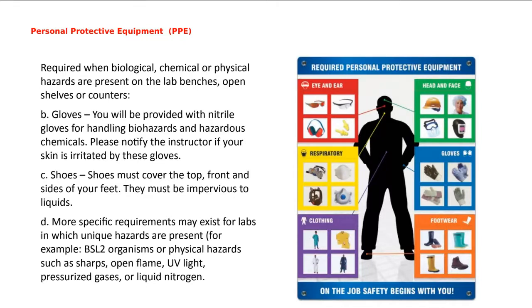Unless we work with just the microscope, which is lab 4, you won't have to wear gloves that day. But any other time when we're working with diluents or solutions or solvents, you'll need to wear gloves, and we'll wear nitrile gloves. You'll have to wear shoes that will protect your entire foot. So you need to have shoes that cover your toes and your heel. Okay, and that's it. We do have aprons in the 1406 lab that if you want to wear them, you can. Not required.